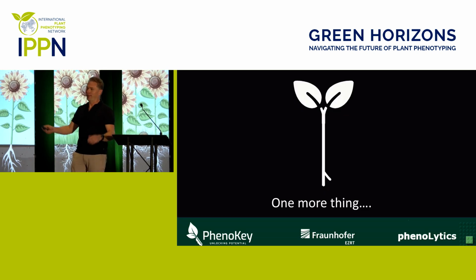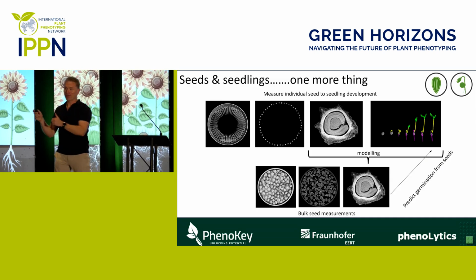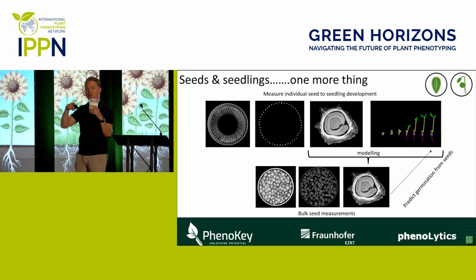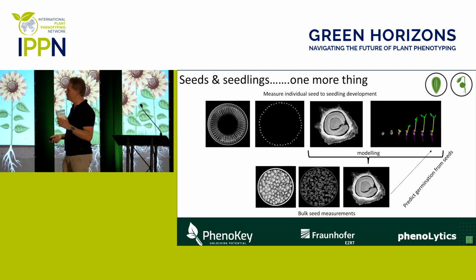One more thing, I always wanted to do this. So we now talked about seeds, we talked about seedlings, but what if we combine the two? Then it gets really exciting. So here we have the pots, we can isolate the seeds. Before germination, we can already look into the seeds and quantify the organs in there, so we know what the seed properties are. Then the seeds are being germinated, and you see the development over time.